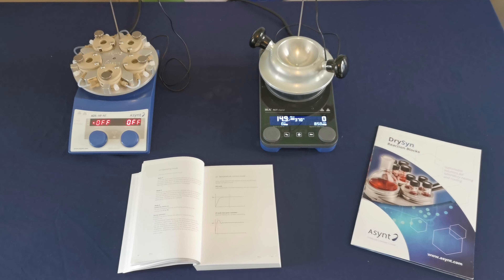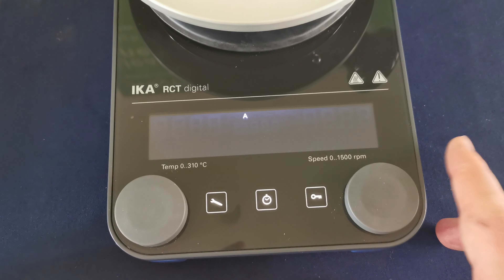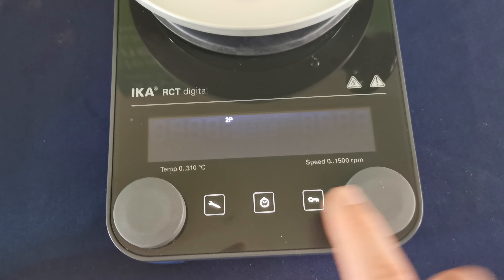If you have an RCT Digital and you want to know what heating mode you're on, you can see it by looking at the main screen. Here we have 2P mode. If you want to change that to PID mode, you click settings, scroll, and it says 2P.